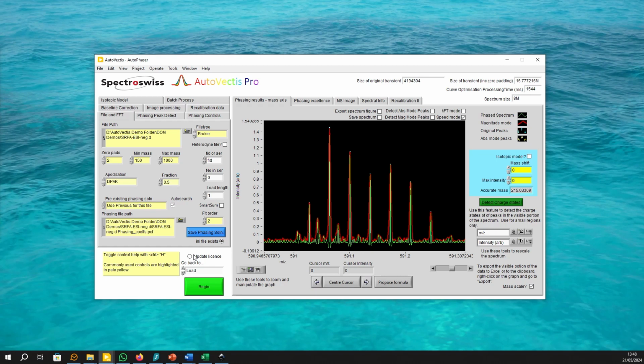If you want to re-optimize a phase correction function to the current spectrum, then you can choose Use Previous for another file. As the name suggests, this also allows you to use a phase correction function that was generated to a completely different spectrum. Phase correction function files have the suffix .pcf and they're saved in the Bruker .d folder itself. When you want to apply and re-optimize a PCF file, then you can browse for it using this control. Then click Begin to start the automated workflow.